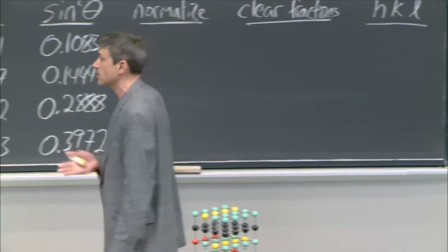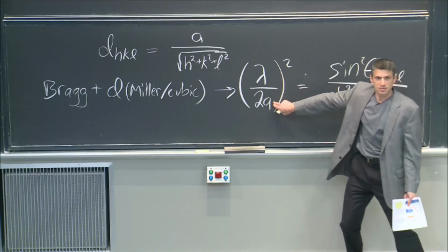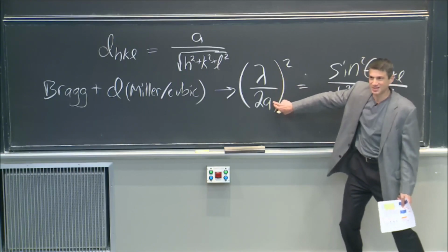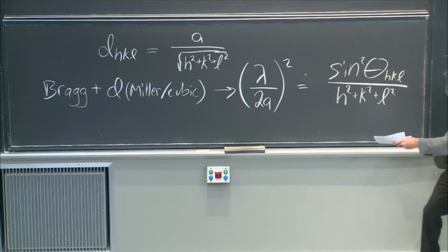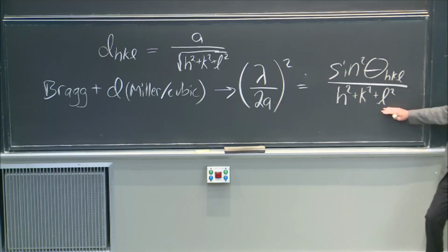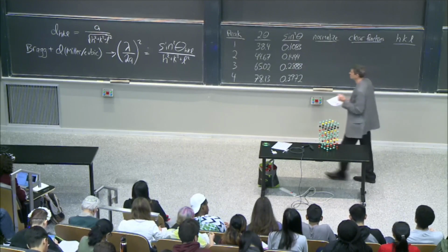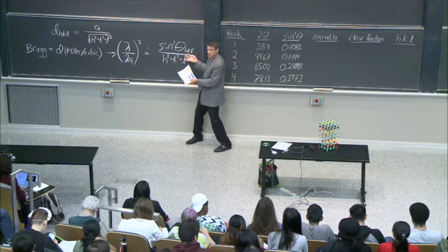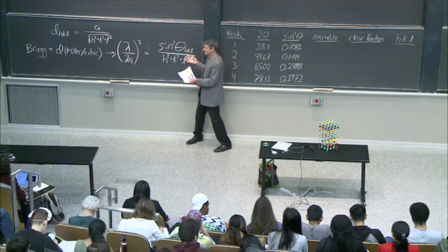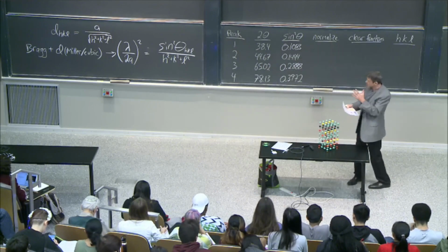So the copper target, K alpha, lambda constant. Lattice constant, that's built into the name, constant. Constant equals the angle and the plane it's reflecting off of. And so our job then in crystallography and doing X-ray diffraction is to figure out how to keep this thing a constant. The same constant, all right? That's what constant means, okay? And that's our job. And that's where we left off.